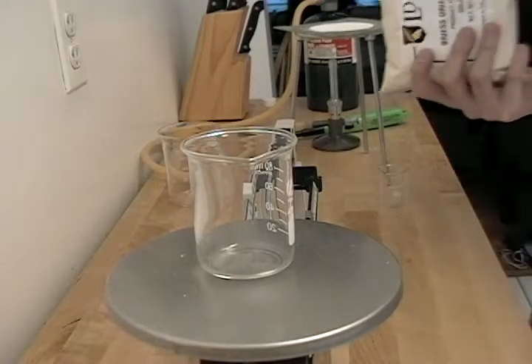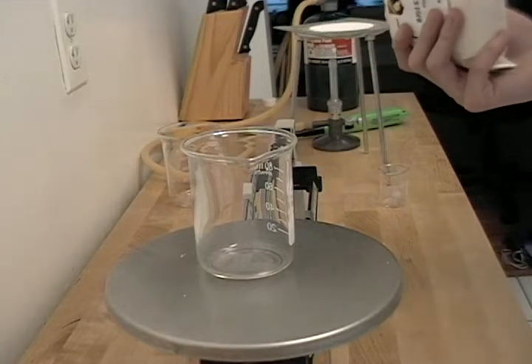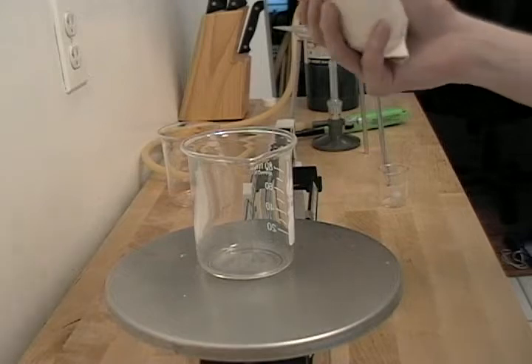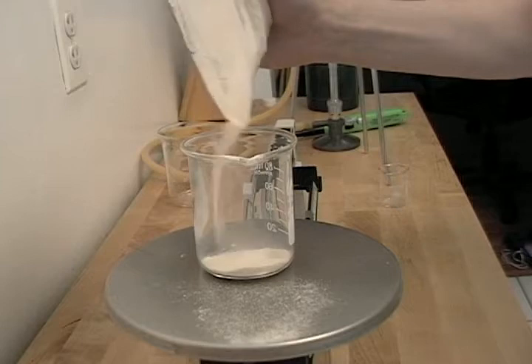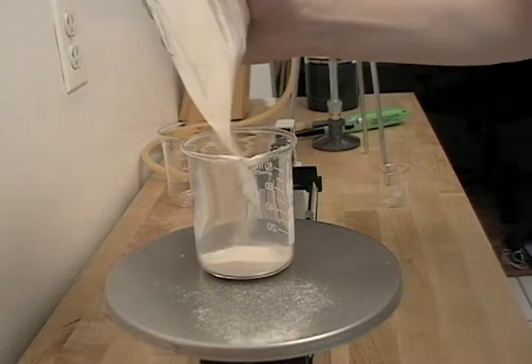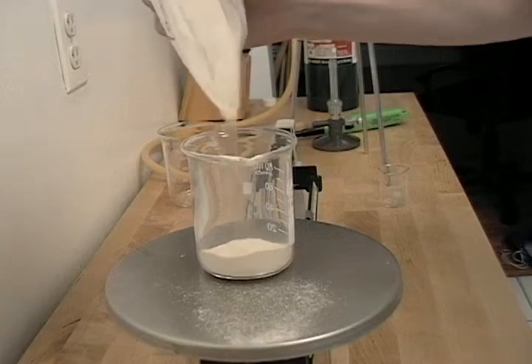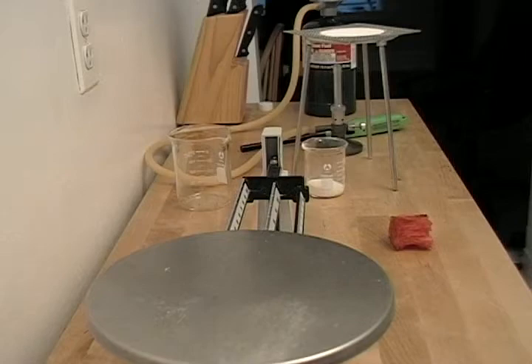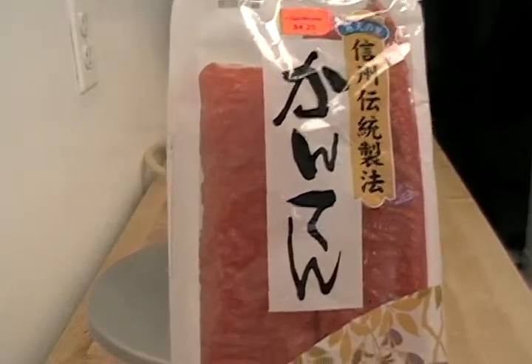Since I'm going to make 100 milliliters of solution for our agar plates, I'm going to measure out 10 grams of dry malt extract. Since we need agar to make agar plates, I'm going to measure out 1 gram of fine Japanese agar.